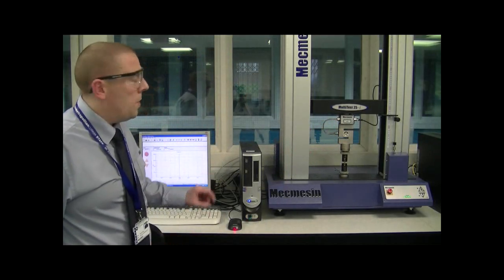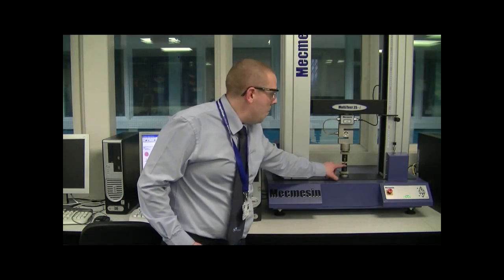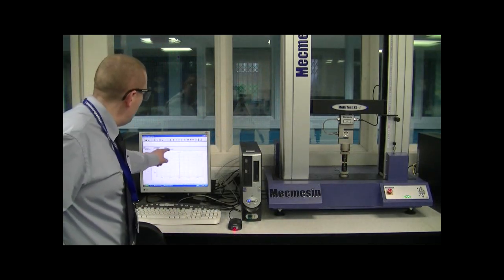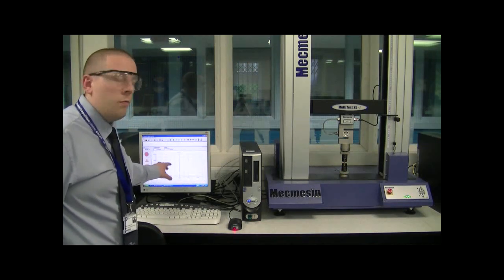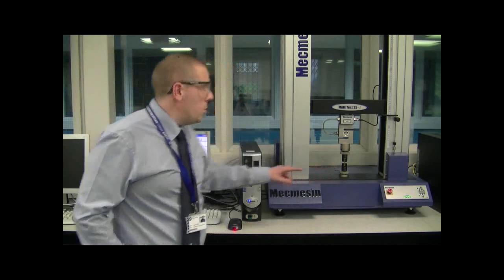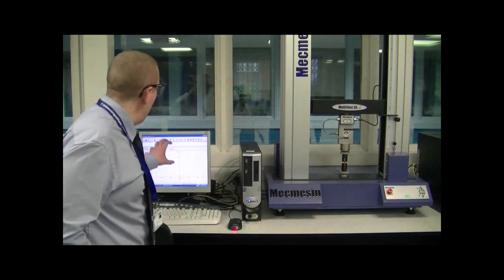What we're going to do today is run the test, and as soon as it begins I'm going to zoom in on the sample so you can actually see what happens in close-up as it moves closer to failure. I'm also going to capture the graph on the computer — this is a live real-time graph. As the force increases, the displacement or stretch of the test piece is going to increase. You'll have an opportunity to see what's happening to the test piece and then review the graph.